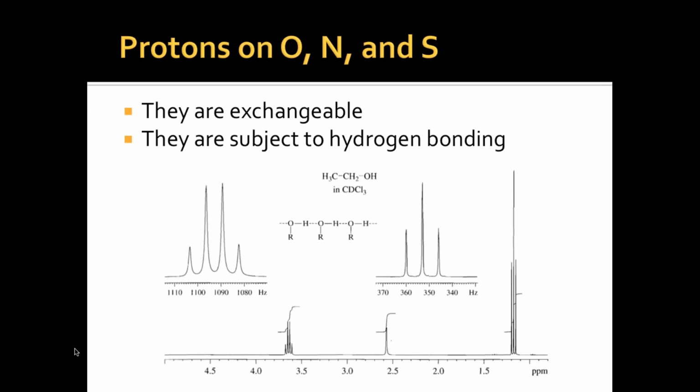CH2 is under the influence of CH3, of course, by n plus 1.